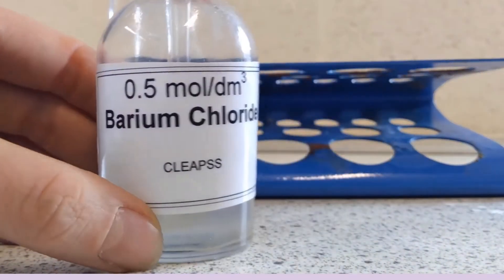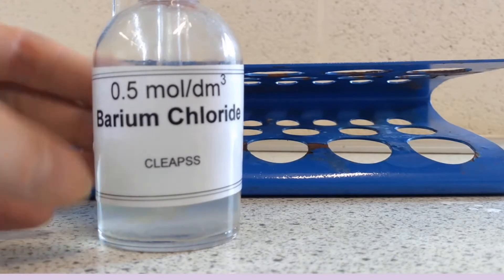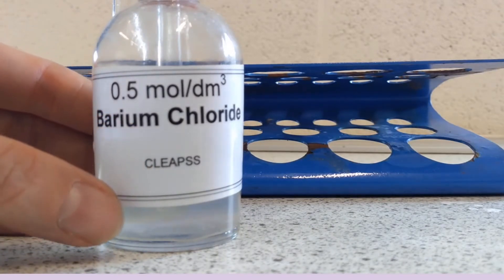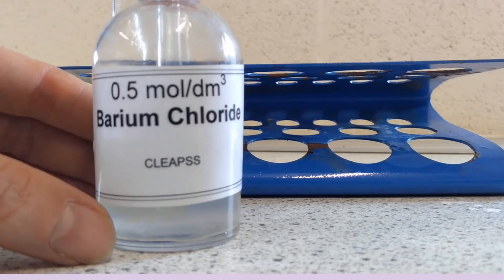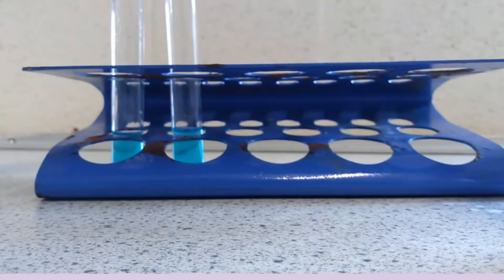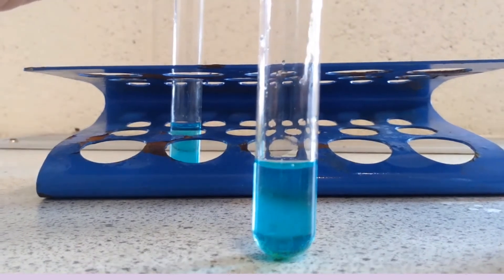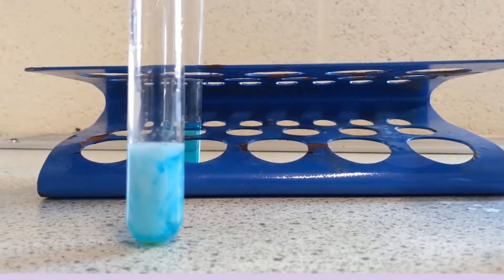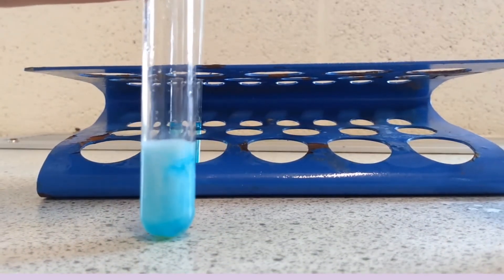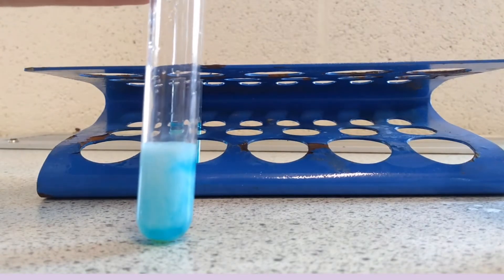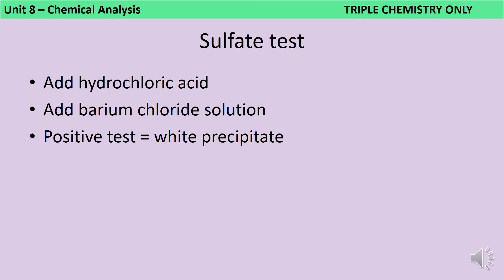Now I'm going to add some barium chloride. If sulfate ions are present, the barium ions will join with those sulfate ions to make barium sulfate, which is a white insoluble precipitate. Adding some to the first tube — not a lot happening, no sulfate ions there. But adding some to this tube, I can see that white precipitate forming. The tube still has a slightly blue colour because there is still copper sulfate in there, but the white solid has formed. The test is: add acid (usually hydrochloric acid) followed by barium chloride solution, and a positive result is a white precipitate of barium sulfate.